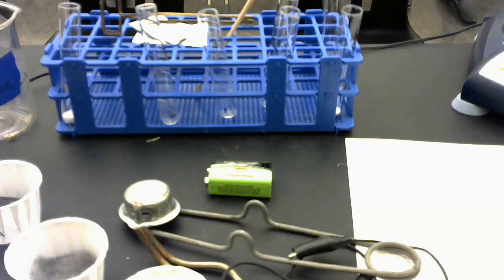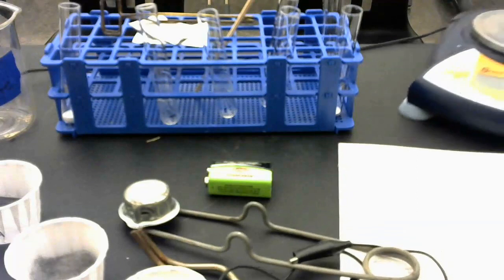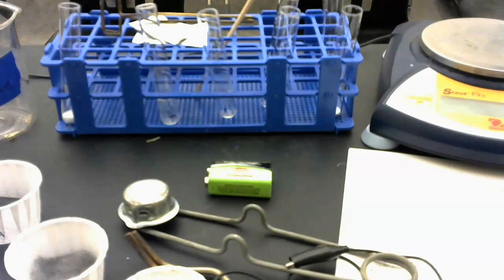Okay. One thing I forgot to state is you also have your scale. I have my scale right over here, and you're going to use your scale for reaction type B. It says station 3. It's going to be lab number 3 that you're going to do, but it's reaction type B number 1. Okay, so let's go ahead and get started. What we're going to do is we're going to look at reaction type A.